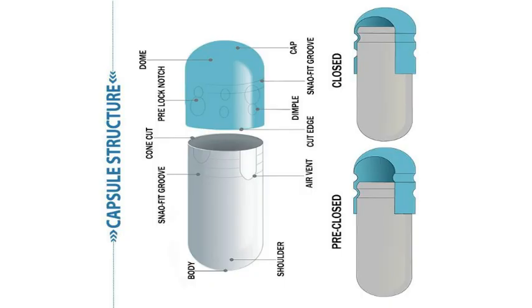In pre-closed position we can see that the pre-lock notch present on the cap gets fixed in the grooves present on the body.